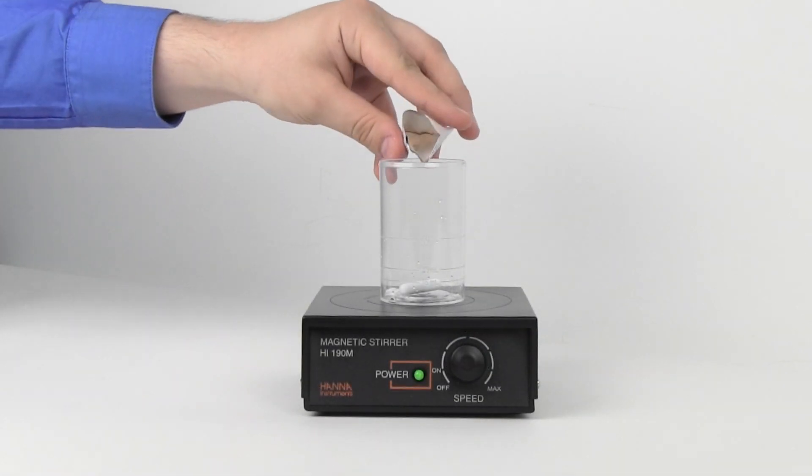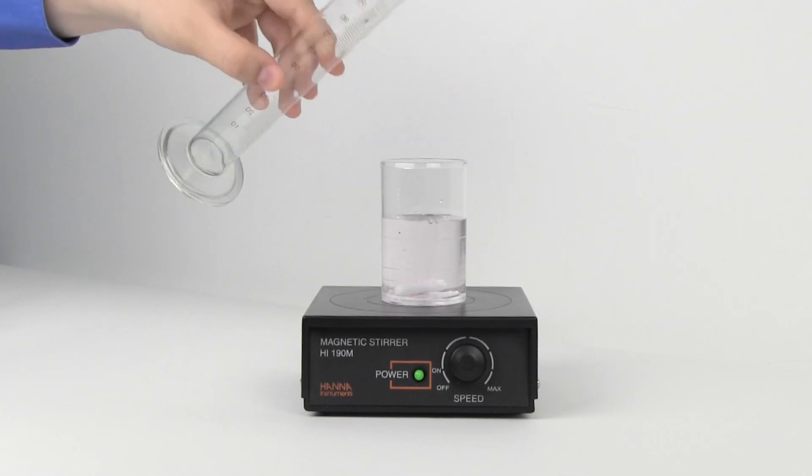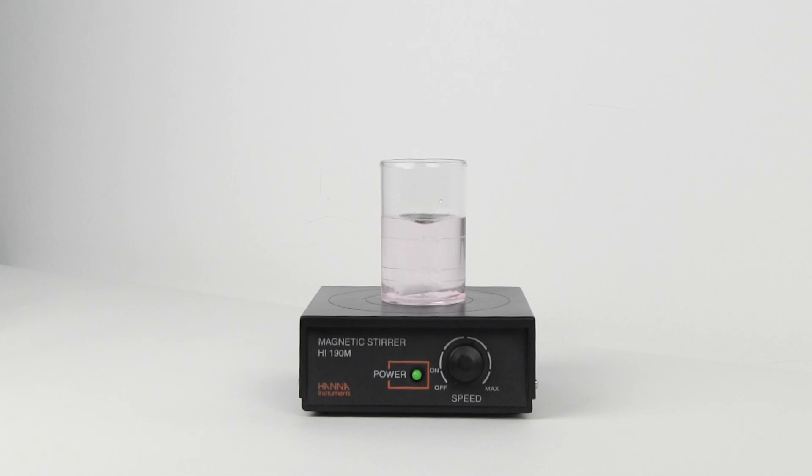To perform the slope check, prepare the buffers by mixing and dissolving each buffer packet in separate beakers with 50 milliliters of deionized water.